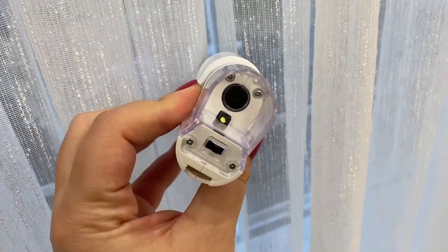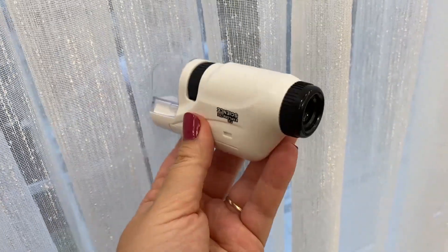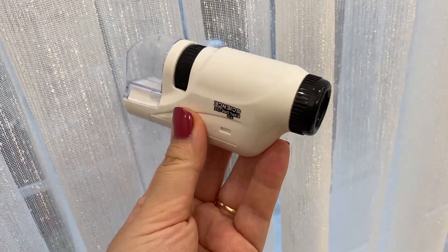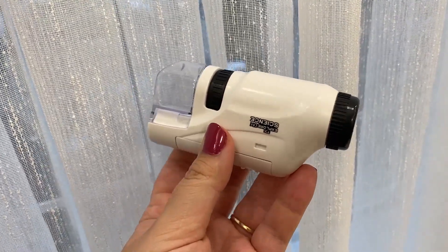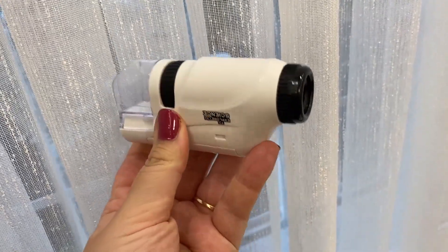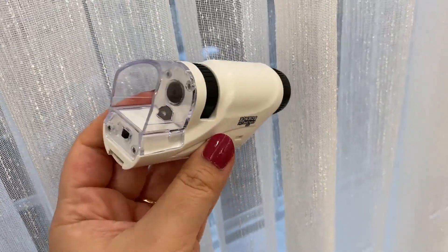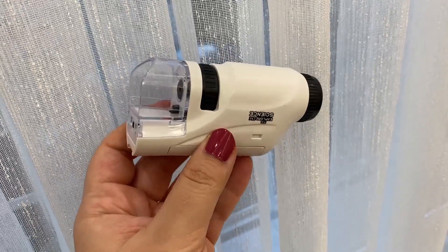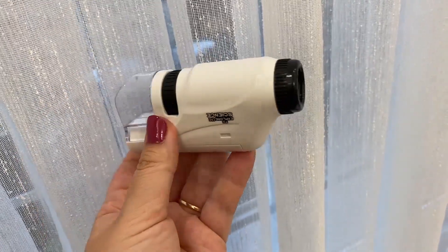It's Chinese — it's from AliExpress, I'm not hiding this fact. But other than this, I had a very positive experience with this microscope and I really cannot wait for my kids to grow up a little bit, become like 5, 6, or 7 years old, and try to use this microscope to discover the micro world around them. Yes, I do recommend this for $15. It's a pretty good deal and I hope you get one without the button problem like mine.